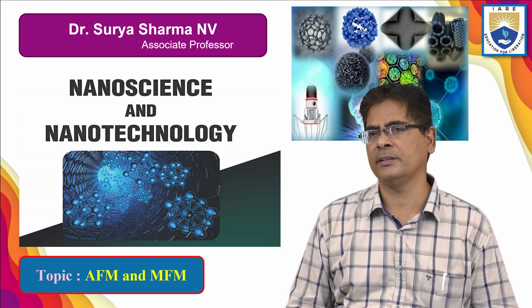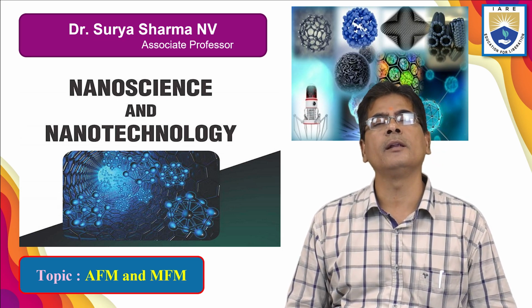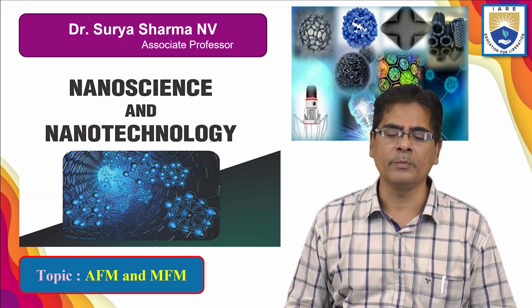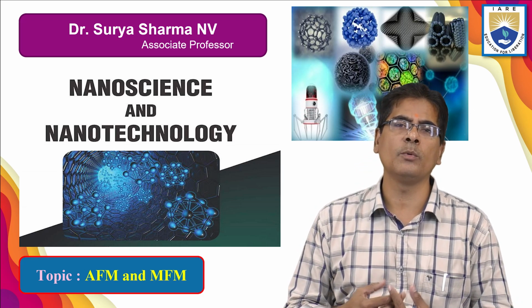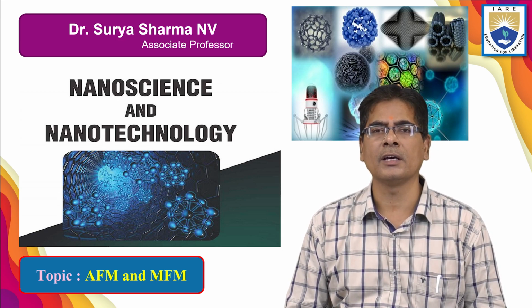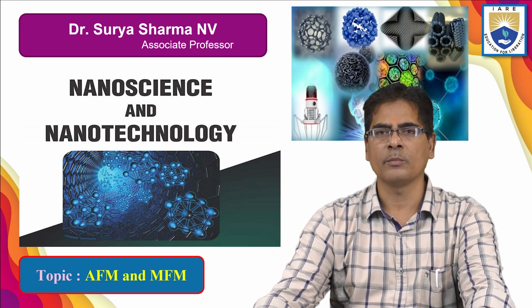After the fabrication of nanomaterials, the characterization is done by different techniques like XRD, scanning electron microscopy and transmission electron microscopy. We have seen individually what scanning electron microscopy is, what transmission electron microscopy is, and the advantages of using each.